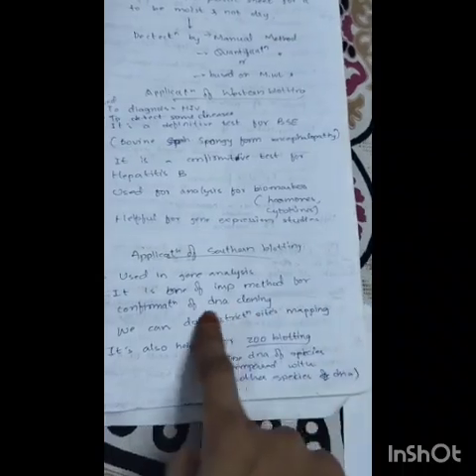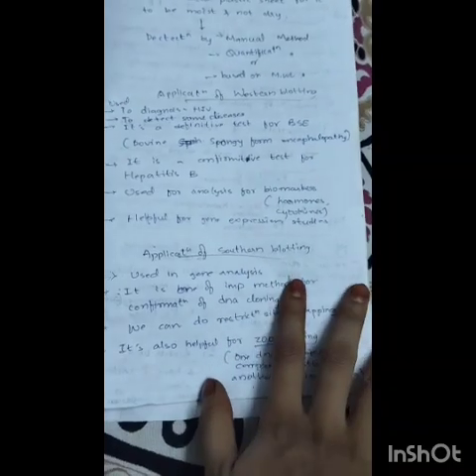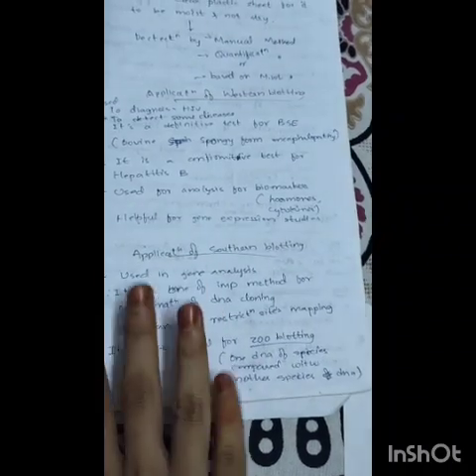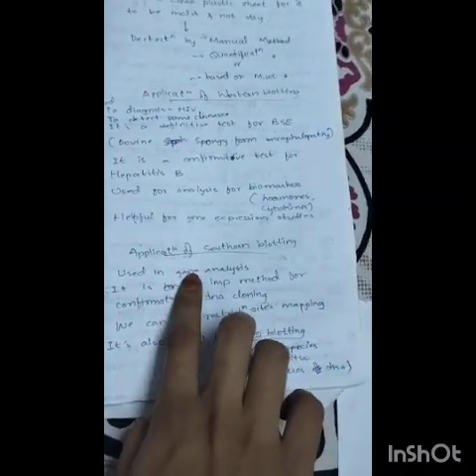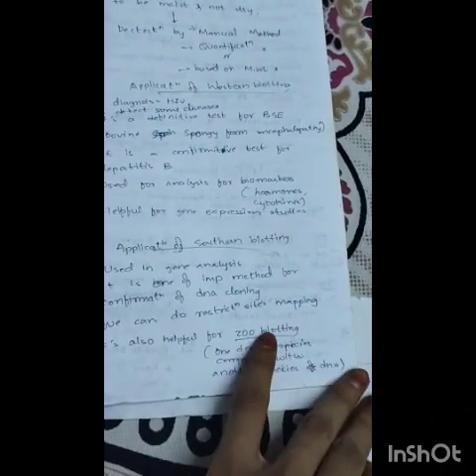Restriction site mapping can also be done, and it is helpful for zoo blotting. So the applications of Southern blotting involve gene analysis, DNA cloning, restriction site mapping, and zoo blotting. It is an important method in DNA cloning, used in gene analysis, also used in restriction site mapping, and helpful for zoo blotting.